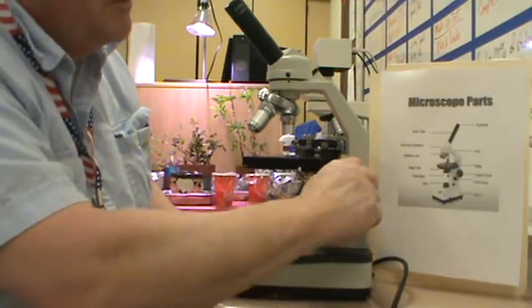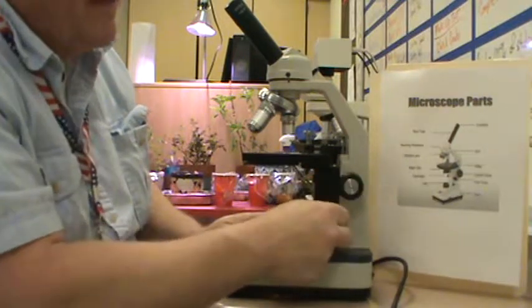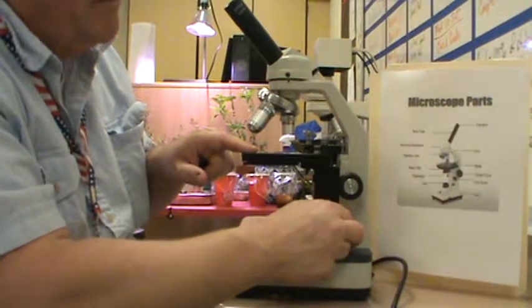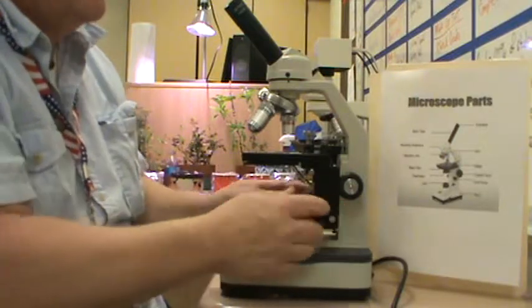Coarse, because when you turn this, the stage moves a lot. The fine, because when you turn this, you get fine movements. I don't even know if you can see this moving. I've got my finger on it. I can't even hardly feel it moving. All right, so then we've come up.